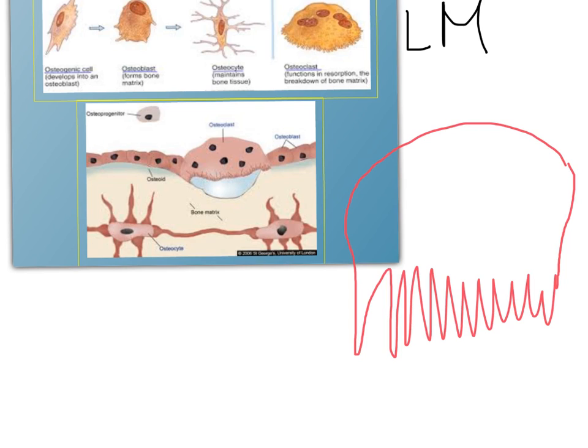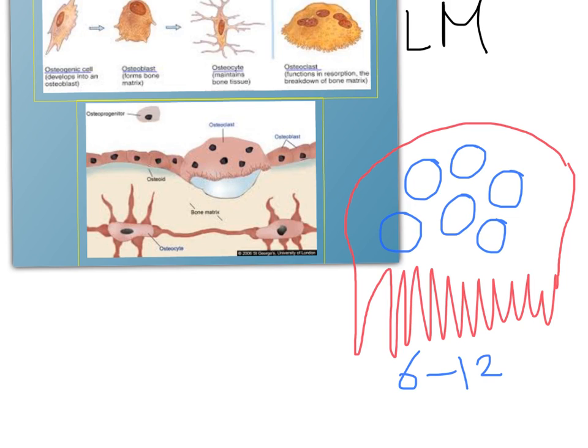As regards the nuclei, they have multiple nuclei, not a single nucleus like that of the megakaryocyte, which is also present in the bone marrow. It has multiple nuclei as it originates from the fusion of blood monocytes. Also very important to know that these nuclei are from 6 to 12. And also don't forget that they have a foamy appearance of the cytoplasm, which is acidophilic.